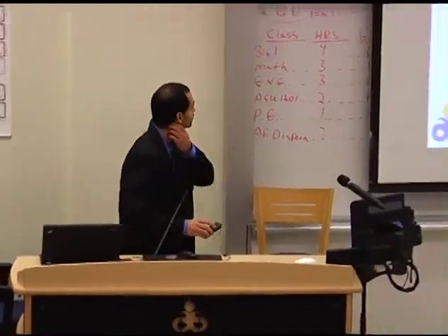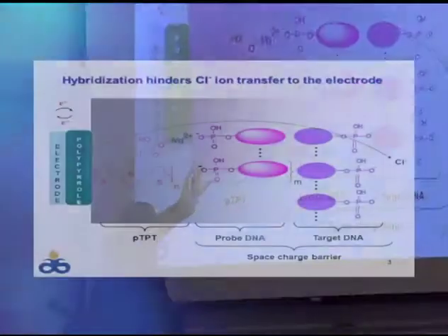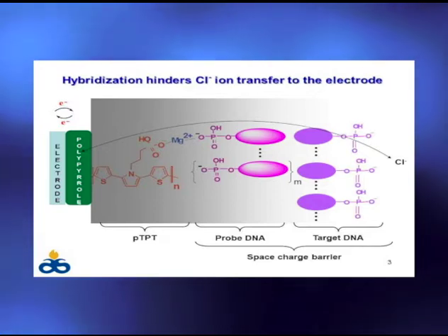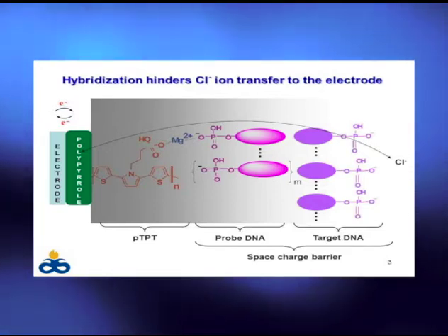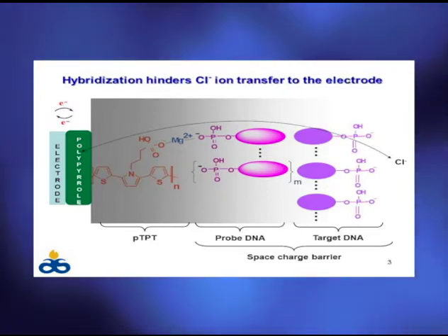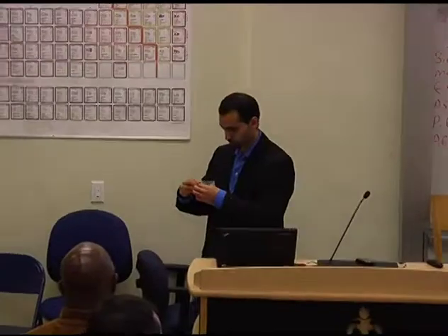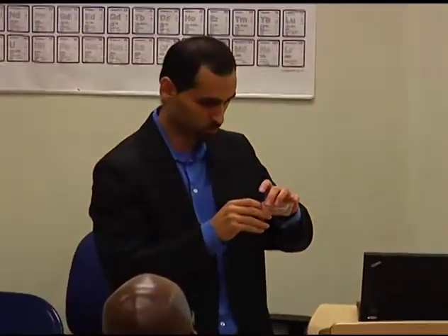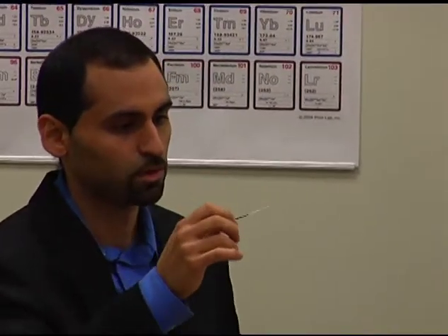So this diagram illustrates all of it put together on the molecular level. What's going on? Well, here's my electrode. This is just a platinum disc electrode. In our case, we're working with the 25 micron, and I actually have a platinum disc electrode here. This is a microelectrode. We made these ourselves. Now you can obviously purchase these commercially as well if you like, but they cost a little over $100, so they're pretty expensive. We needed close to 50 of these for work over a couple years.